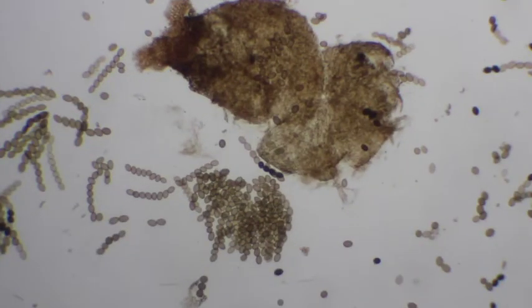What we have here is a compound microscope. We're under the 10x objective for a total of 100x magnification. The way that these fungi reproduce is that they go through a round of meiosis, then they go through a round of mitosis to make spores. So if you think about people, one round of meiosis in people, right?